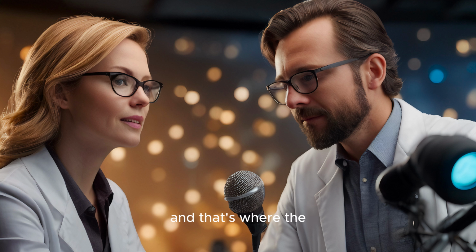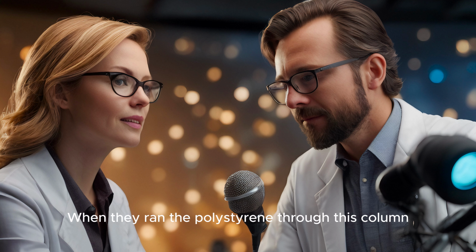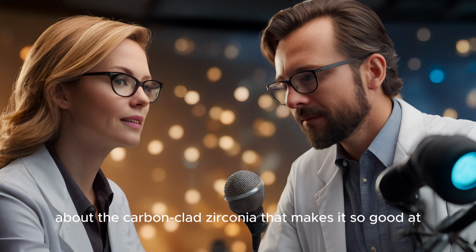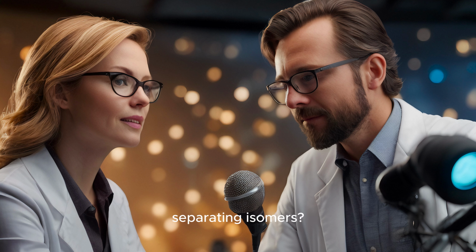And that's where the carbon-clad zirconia column really shines. When they ran the polystyrene through this column, they saw a much more detailed separation. It's like suddenly having a high-definition picture instead of a blurry one. That's fascinating. What is it about the carbon-clad zirconia that makes it so good at separating isomers?